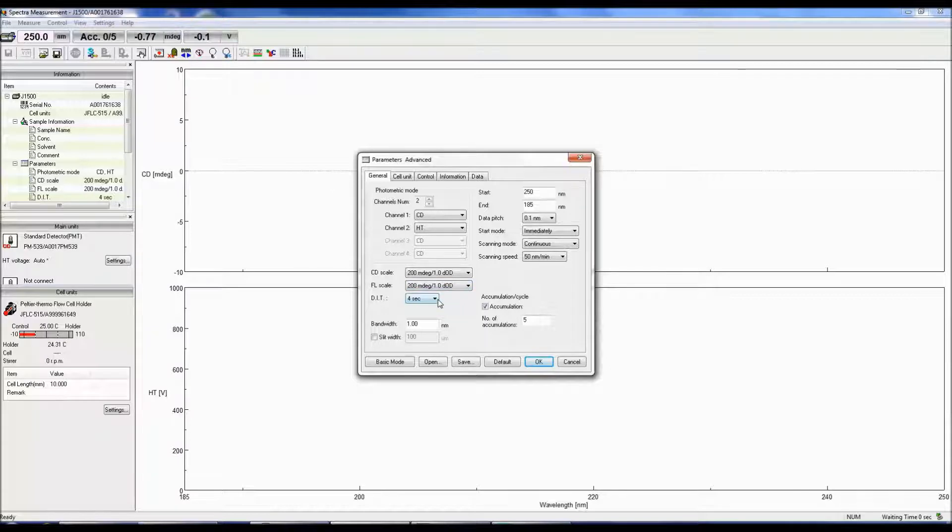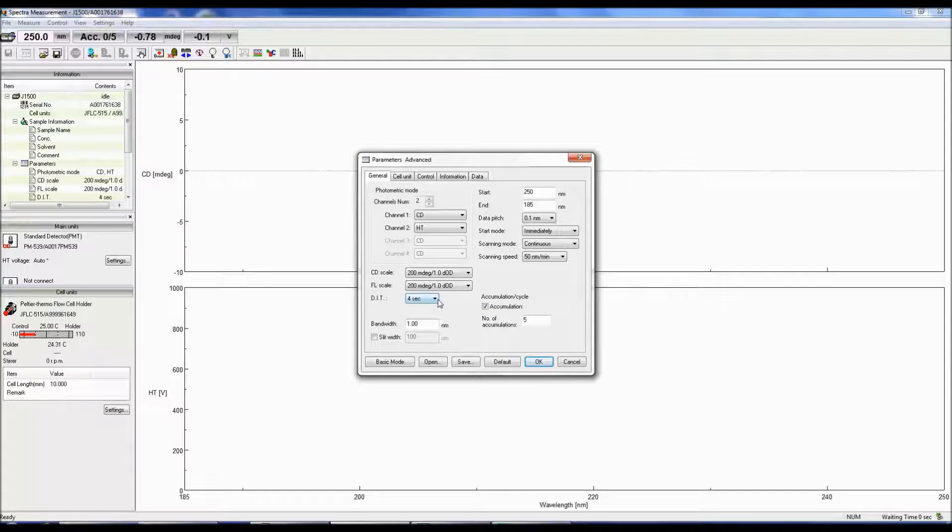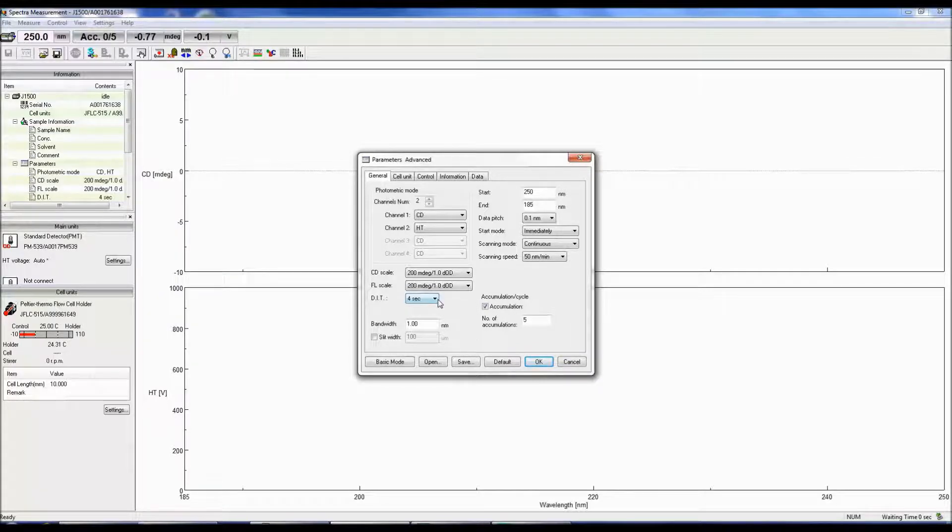The DIT is the digital integration time or the response time. The longer the integration time, the better the signal to noise. Again, a good starting point for selecting the DIT is 4 seconds.